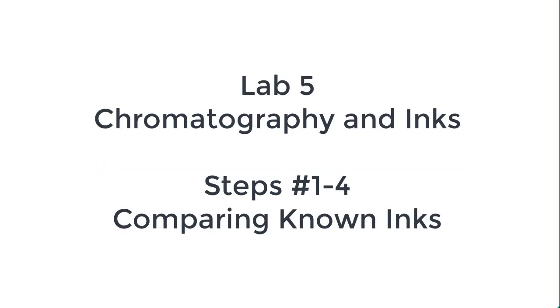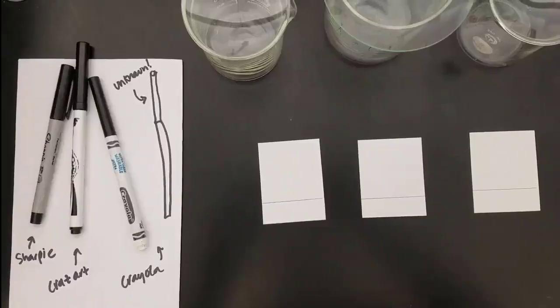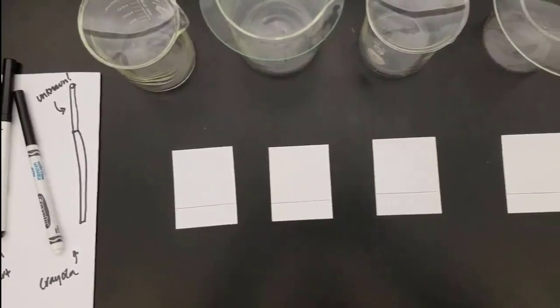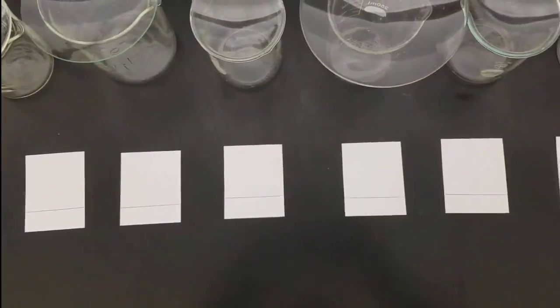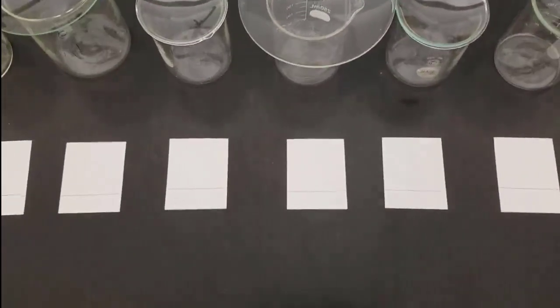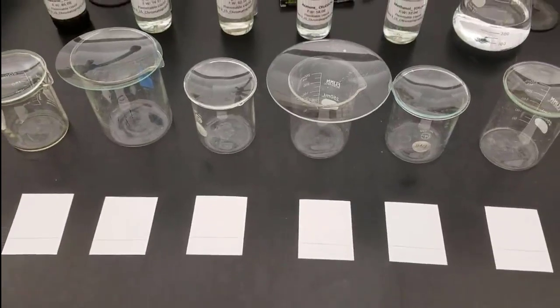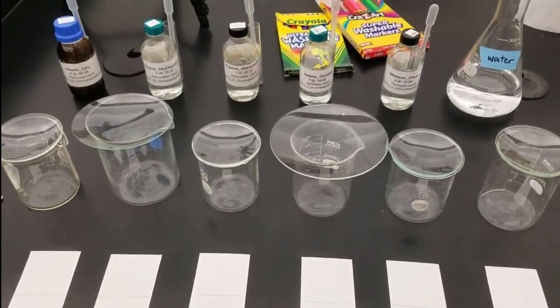Today we're working on lab five looking at chromatography and inks. The first thing you're going to see is steps one through four comparing known inks. As you can see there on the left, the inks we're using are some black inks. We've got some filter paper with lines prepared along with six beakers.